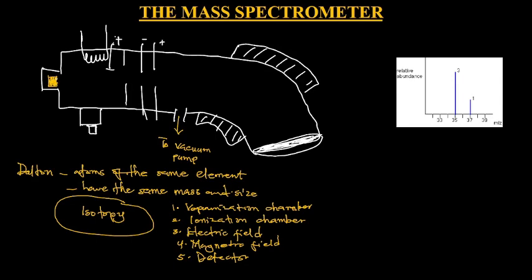This sample gets heated by this filament, so we can label this heated filament.